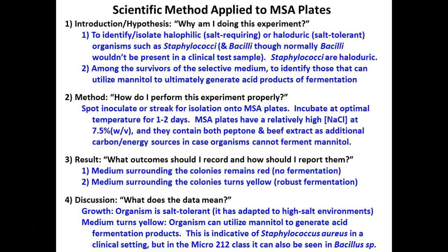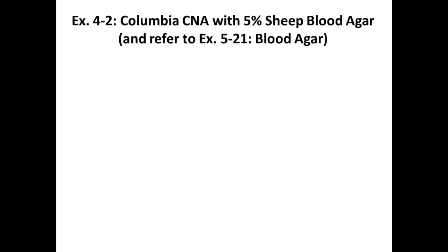One of the bacillus species, and actually, who's got the yellow plate? What do you think you've got? Bacillus. I won't spoil it for you yet, but... Nope. It's one of the bacillus.